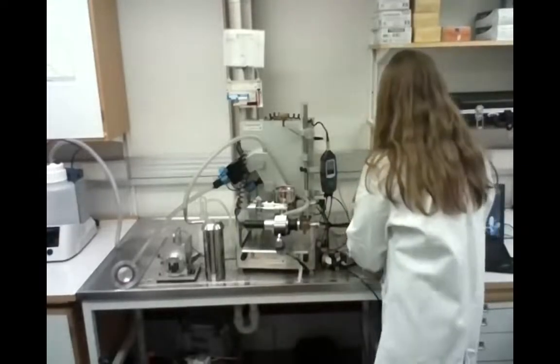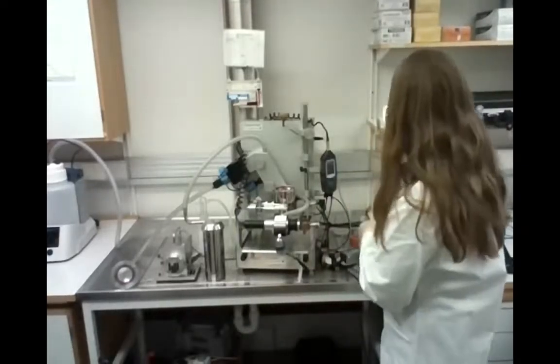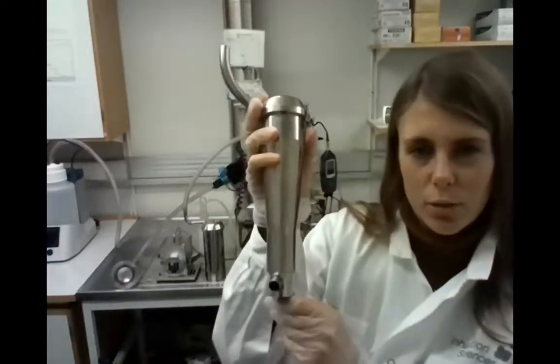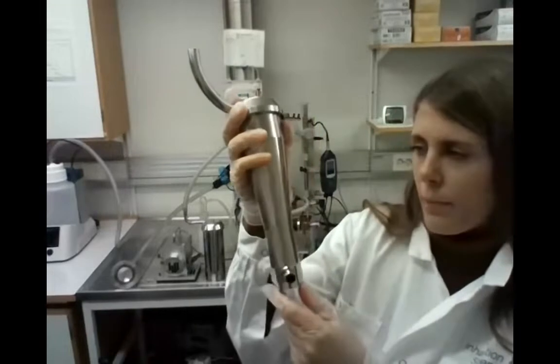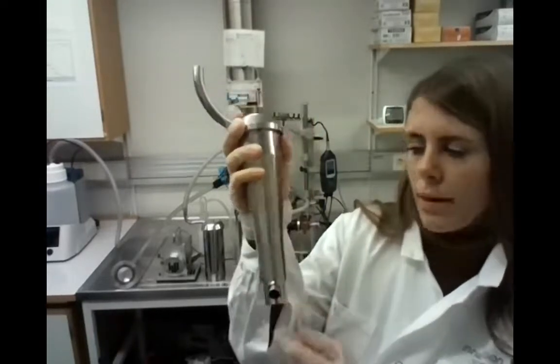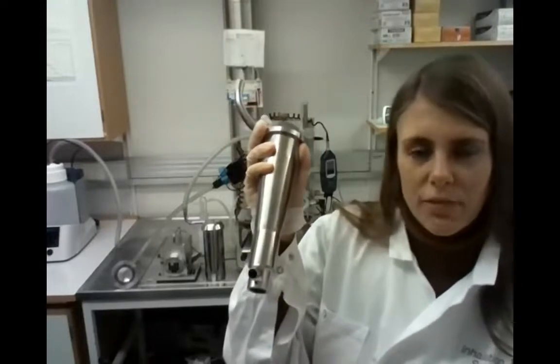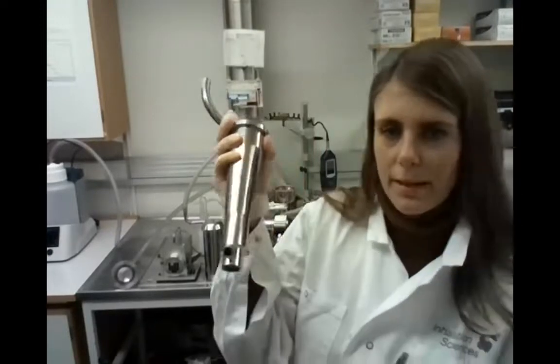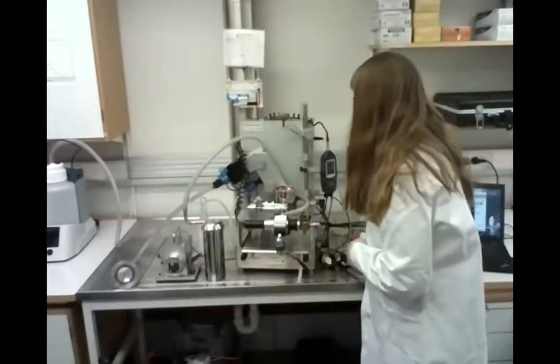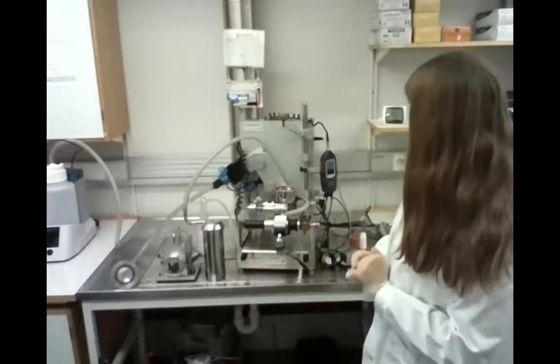And I will also show you this. This is another option if you're not using Dissolvit. You can use this 300 milliliter holding chamber. We also have a bigger one with 1500 milliliters, depending on what you're going to dose. So I think that's basically it. So thank you very much, and let's go back to the presentations.